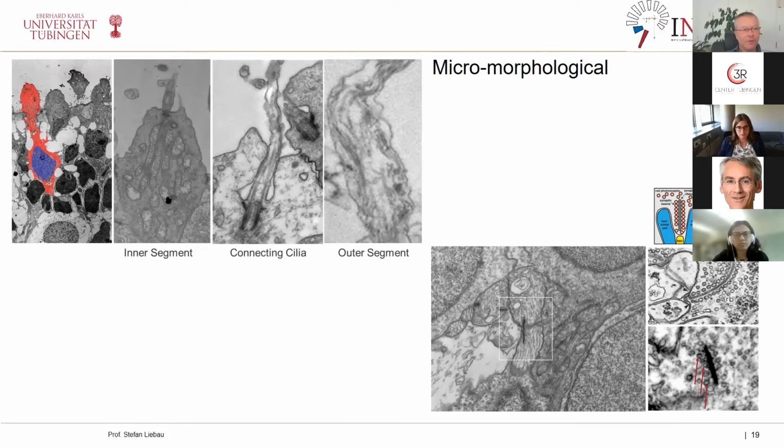Nevertheless, in the more inner parts, where you would see and find the synapses between different cells, so for example, between the photoreceptors, the horizontal cells, and the bipolar cells, here in the lower right picture, you can see that what we find in our cultures is really representing in every step and every way ultrastructurally what we would also find in the physiological human retina.